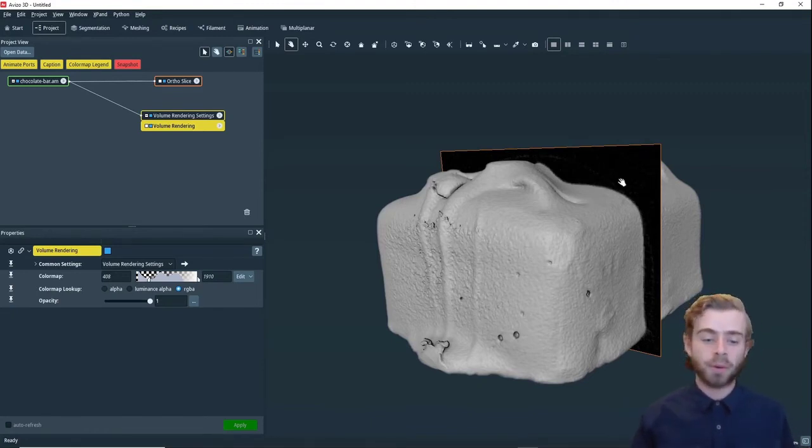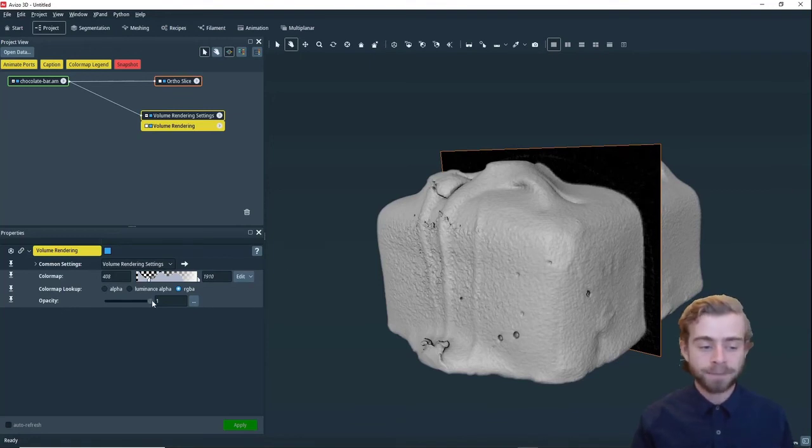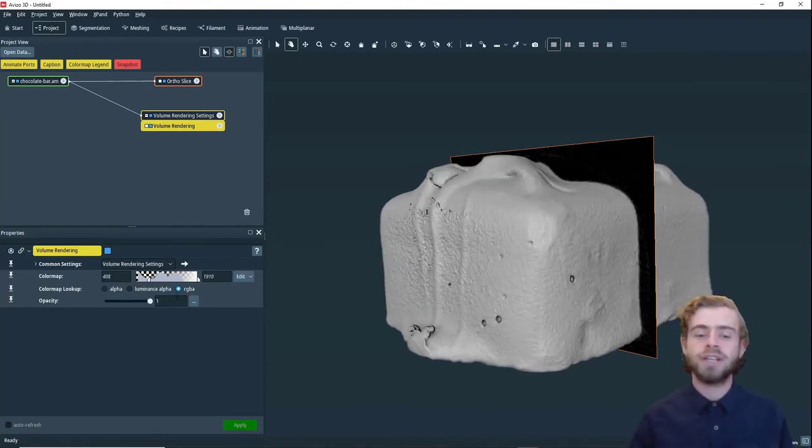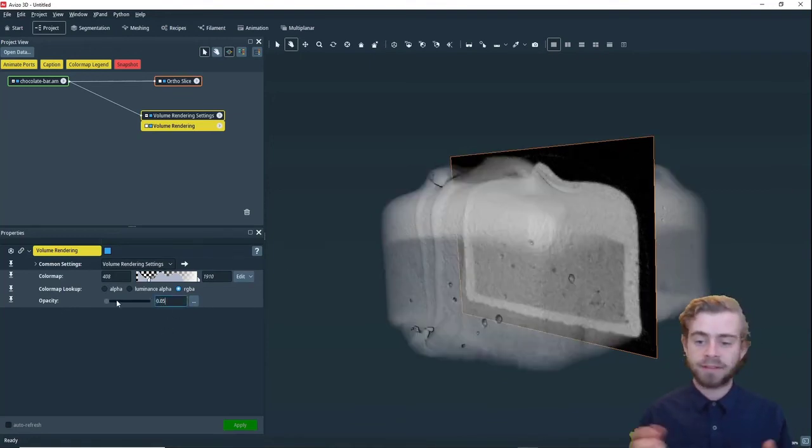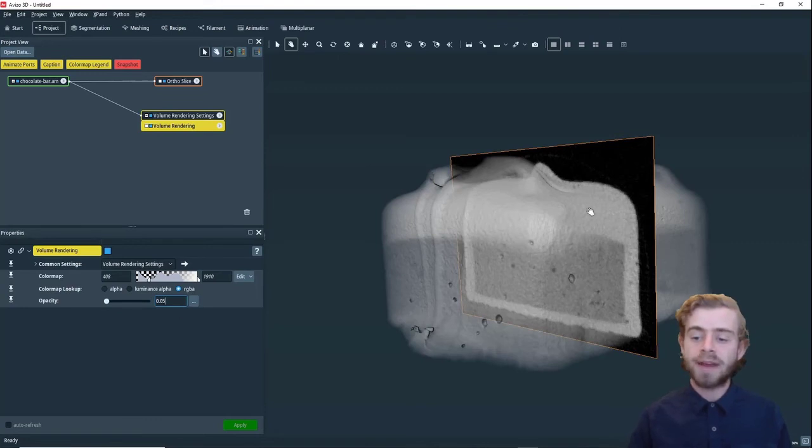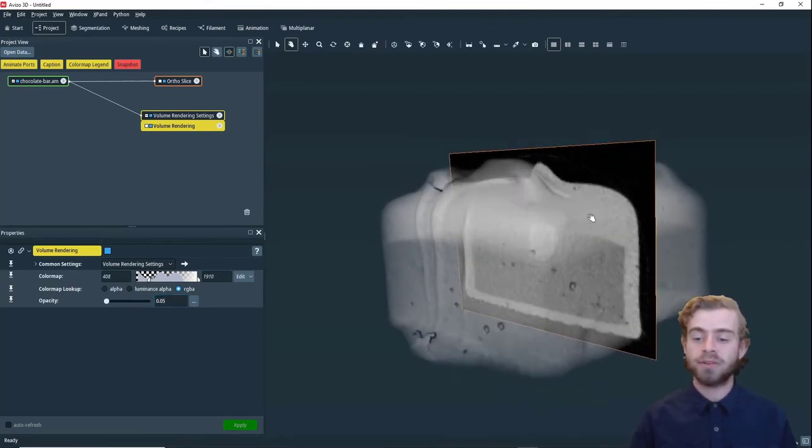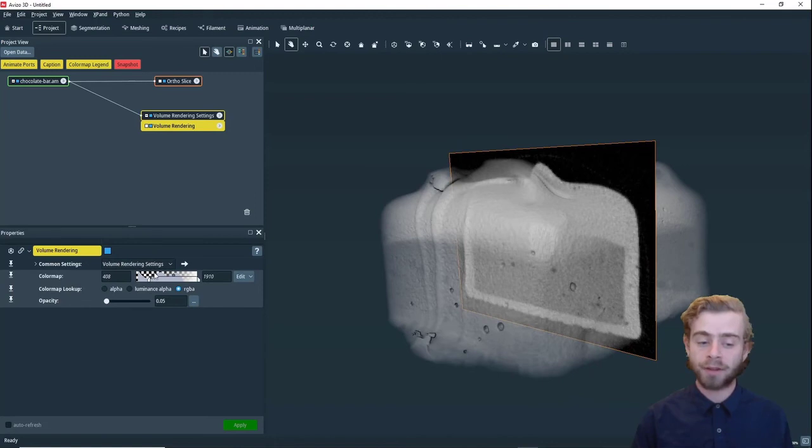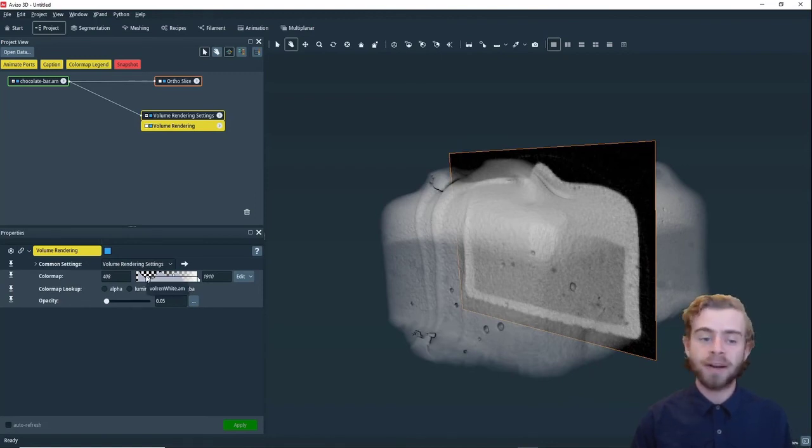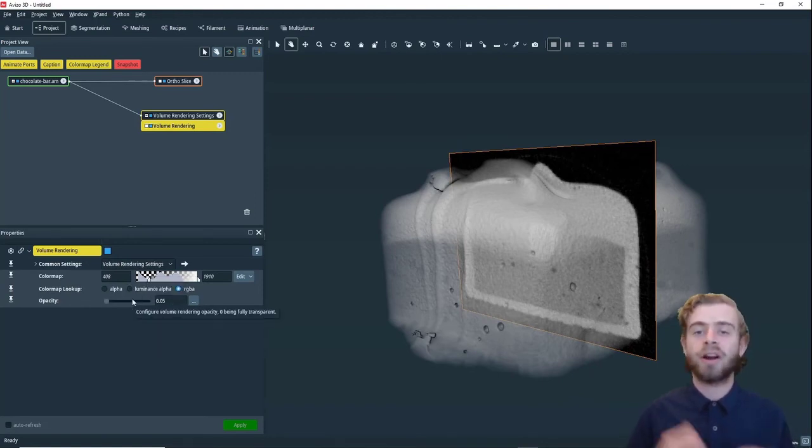So to make it so we can see the ortho slice better, we're going to change the opacity to around 0.05 like so. So now we can see the ortho slice on the inside, but instead of only the pixels near the bottom of the color map being transparent, now all the pixels are at least slightly transparent.